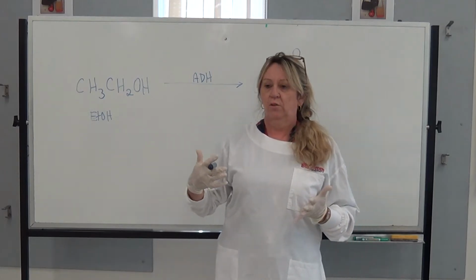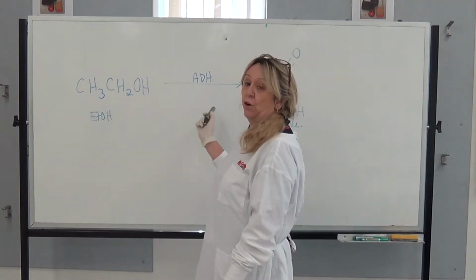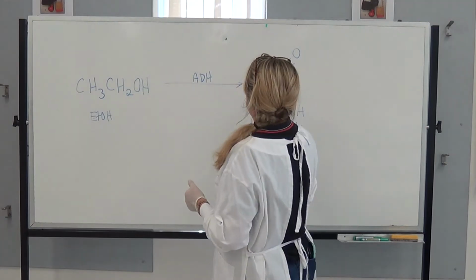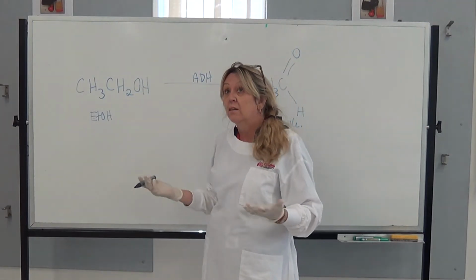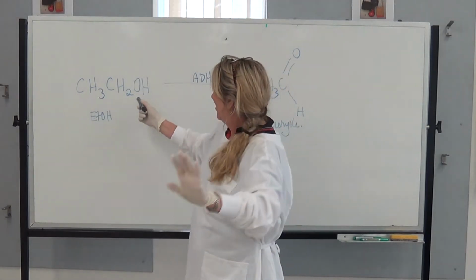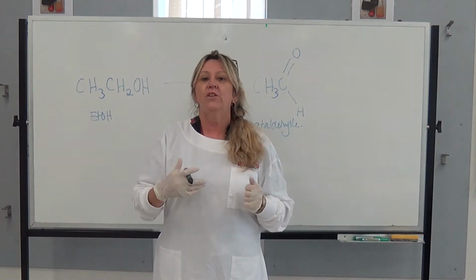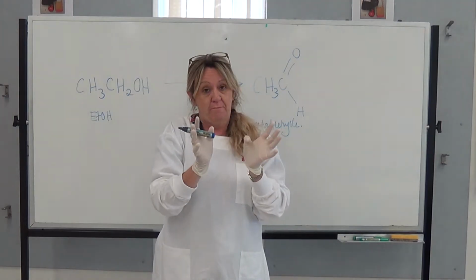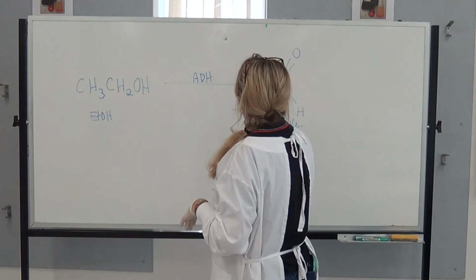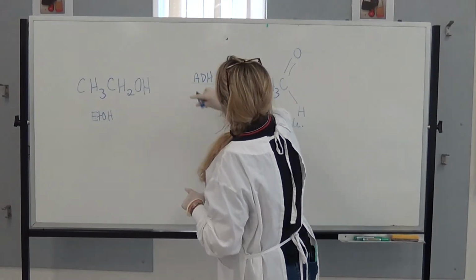And that's all great, so we know how that metabolizes and we can do that in our lab, but how are we going to know when this reaction occurs? Because we're not going to see it, there's no way that we can measure it, except by drinking it and hanging around for an hour, but again, that's not suggested. So in science, we sometimes couple reactions together. We take a reaction that we know we can measure and couple it to the reaction that we want to test. So in this case, we're going to couple this reaction to one using NAD+.